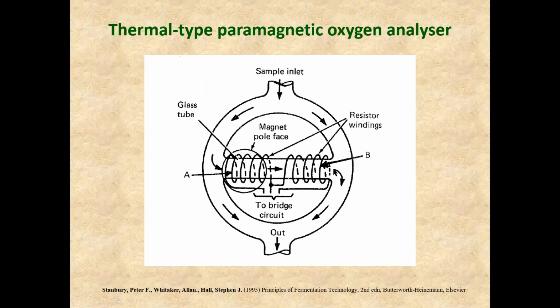So the heated oxygen will come out of the central tube, you can see these arrows here, and will be displaced like this. But the sample is continuously passed through here, so the cool oxygen in the incoming gas will now be attracted. This cool oxygen in the incoming gas would still be attracted to the magnetic field.